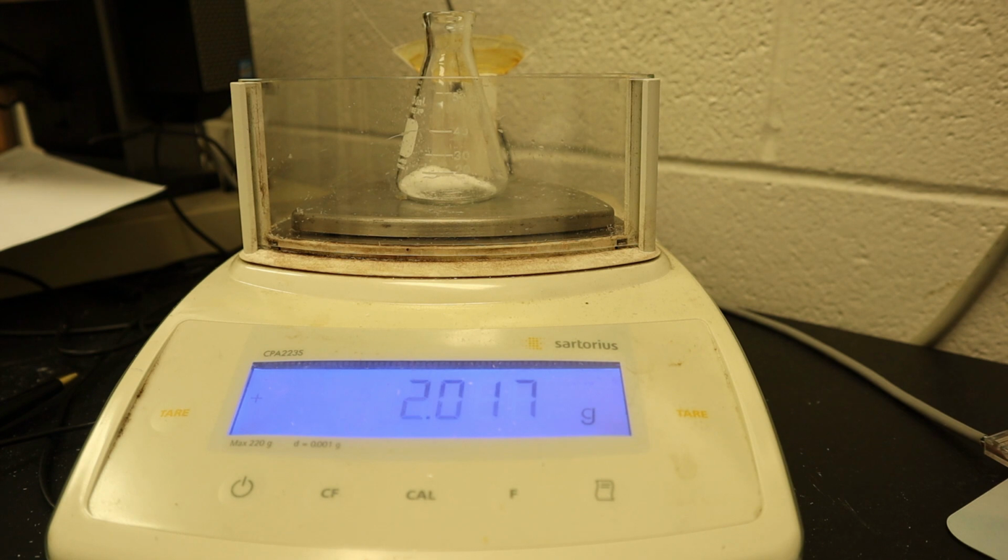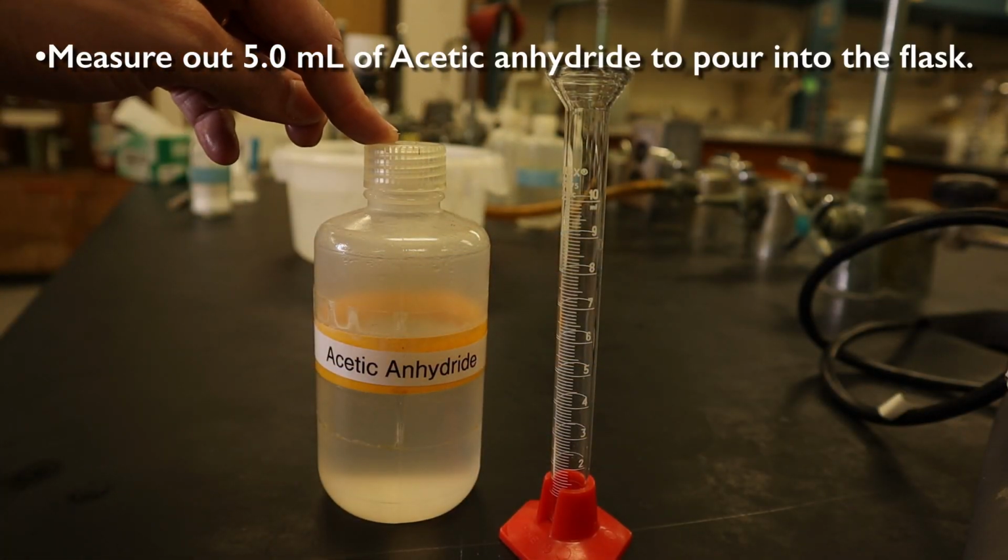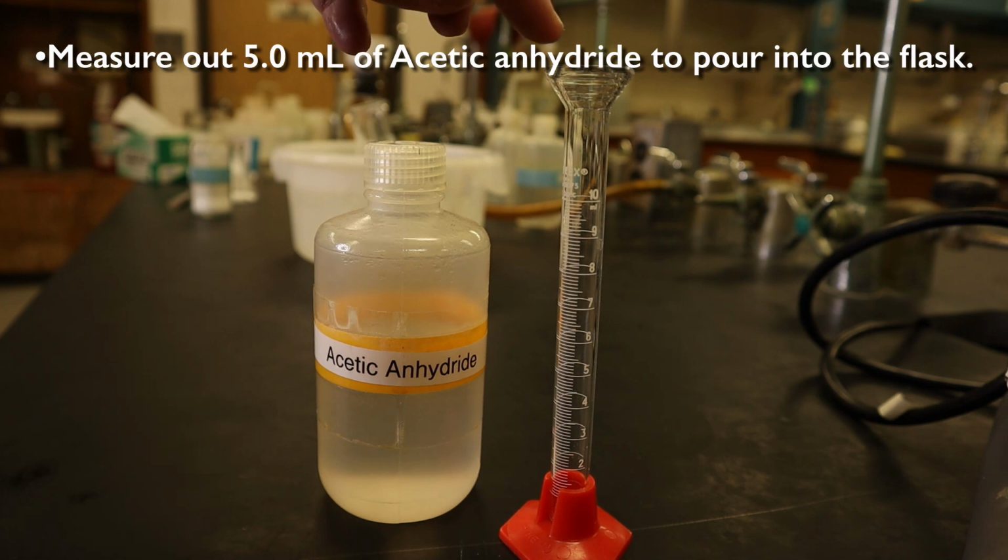That's close enough. Now we're going to obtain about 5 milliliters of this acetic anhydride using this graduated cylinder.